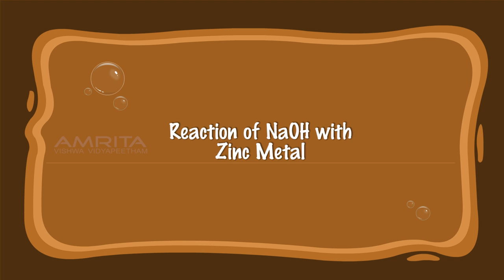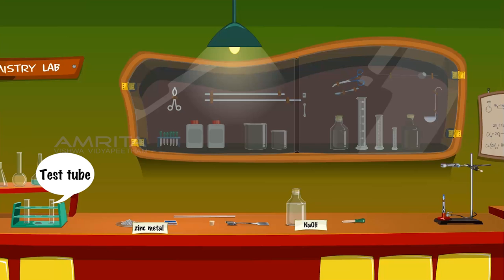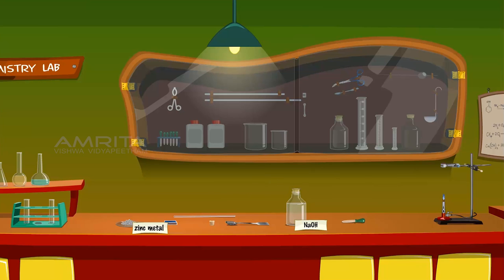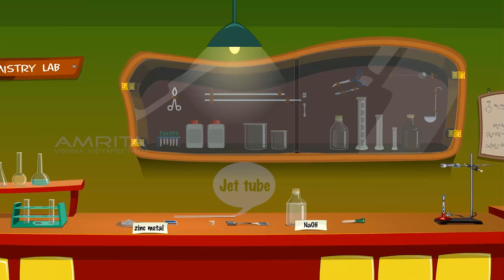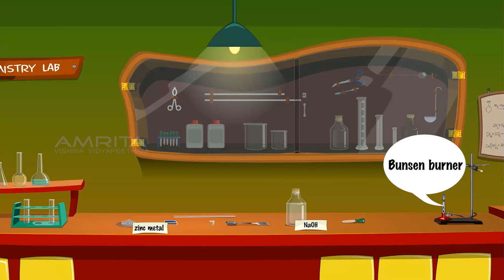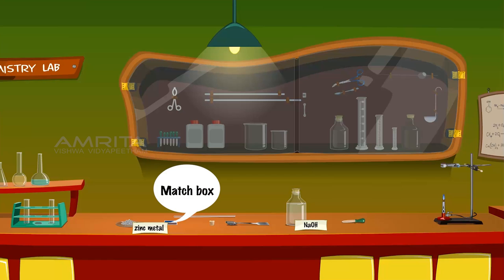Reaction of NaOH with Zinc Metal. We require a test tube, some zinc metal in a dish, a spatula, NaOH solution, a dropper, a stand with a clamp, a single board cork, a jet tube, Bunsen burner, and a matchbox.